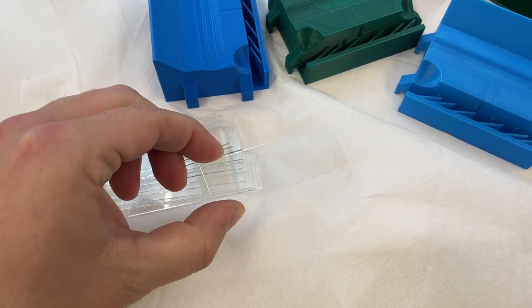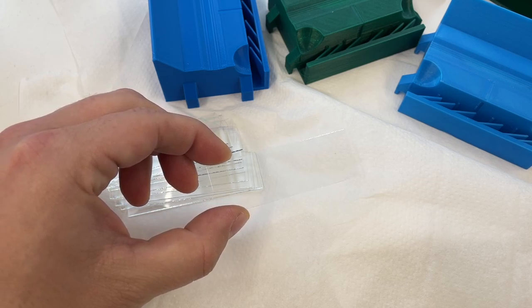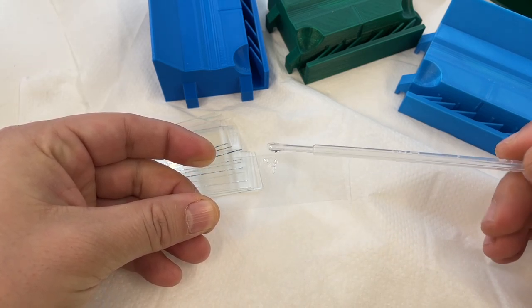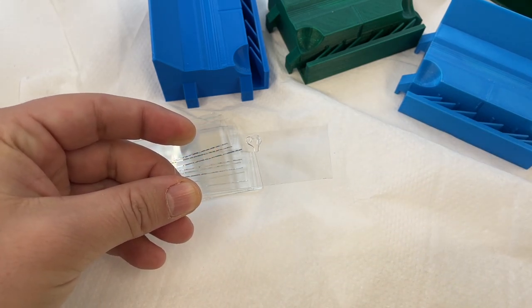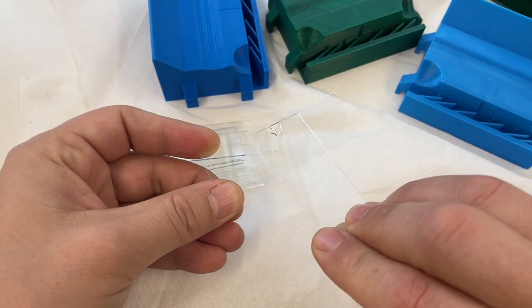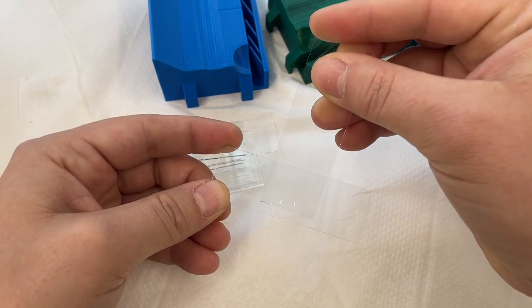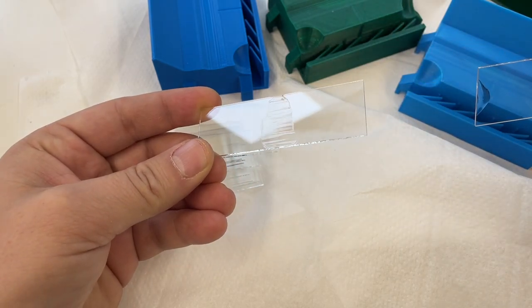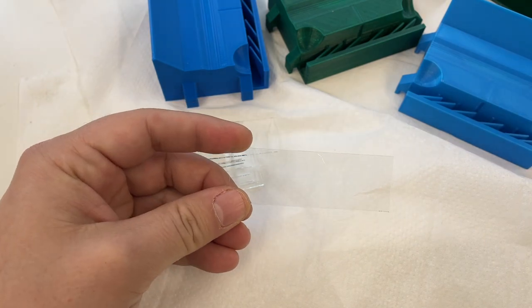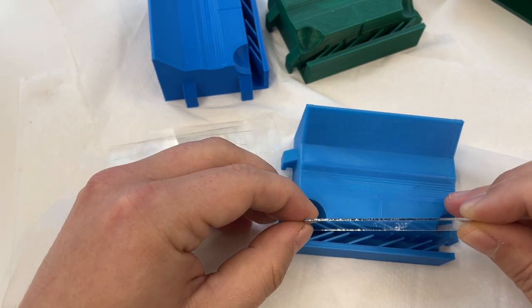Here we have our nice, clean glass slide. You can use different things. You can use, for example, scotch tape or double scotch tape. You can use oil, but I found that this thick silicone oil works perfectly. You just need something that makes the particles stick. So I put a drop of silicone oil. I make it thin with another glass slide so that I have a thin layer of this silicone oil. And the point here is to have something that doesn't evaporate. So you want this to keep working for days without evaporating, and it should be something sticky.